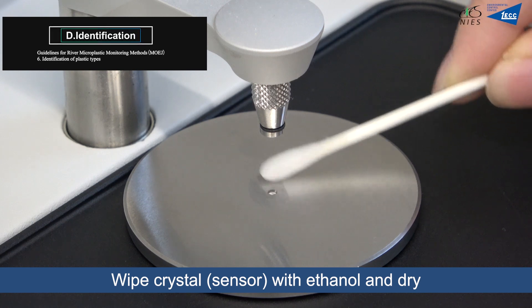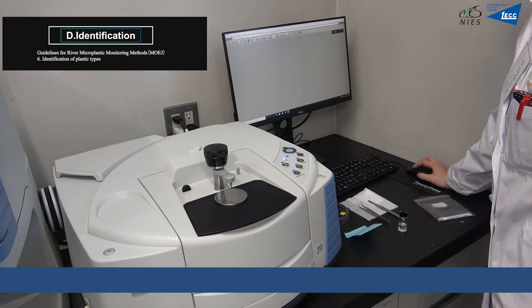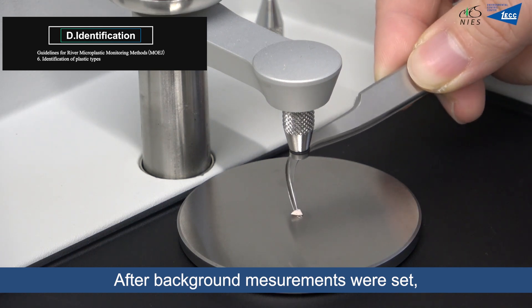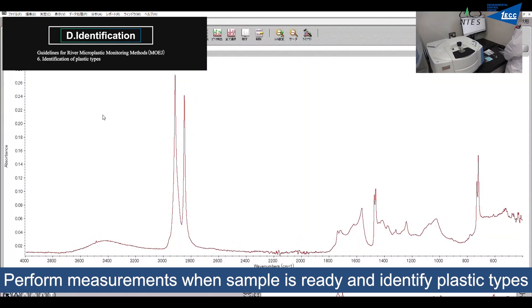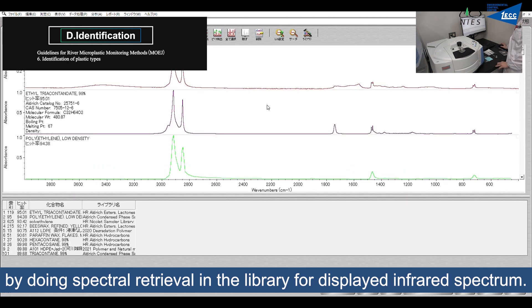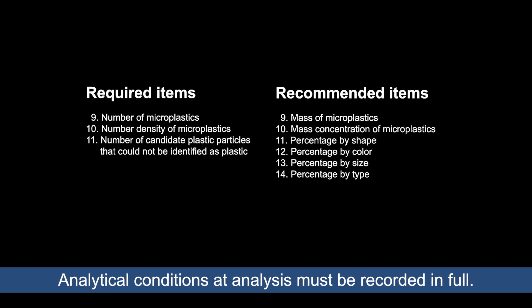Wipe the crystal with ethanol and allow it to dry sufficiently before performing FTIR analysis. Configure the measurement conditions and perform background measurements. After background measurements are set, clamp each sample to the crystal one by one. Perform measurements when the sample is ready and identify plastic types by conducting spectral retrieval in the library for the displayed infrared spectrum. Record and save the data. Analytical conditions at the time of analysis must be recorded in full.